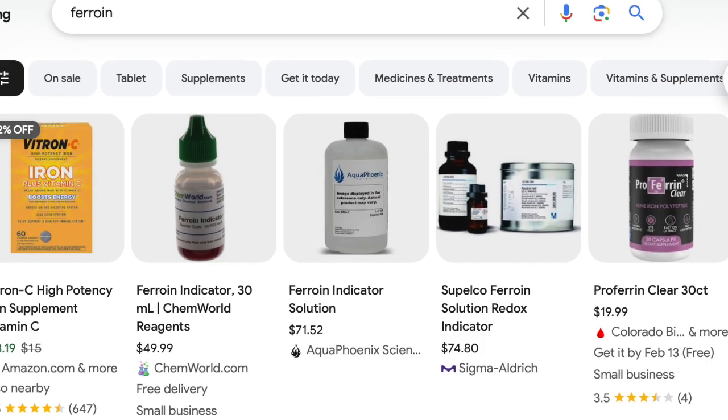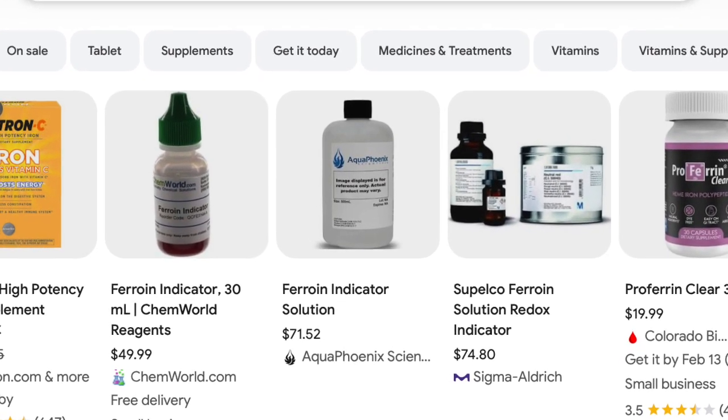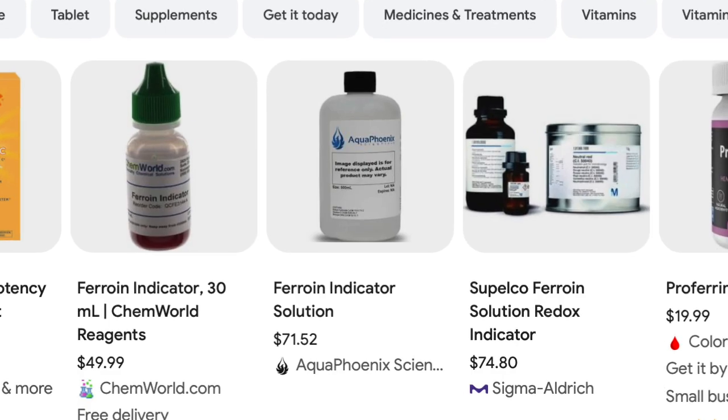In the first episode of this series, we discussed its color-changing properties upon exposure to various chemicals with different redox properties. However, ferroin itself is a relatively expensive reagent to acquire. While its acquisition is not particularly challenging, its high price and the tedious preparation procedure limit its accessibility to a portion of amateur home scientists.